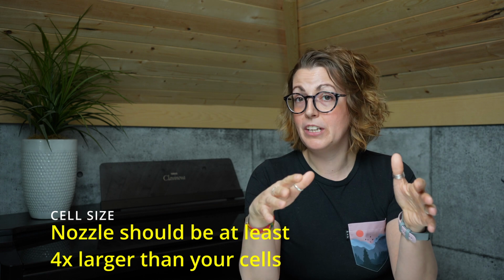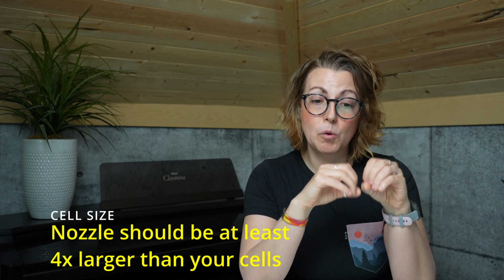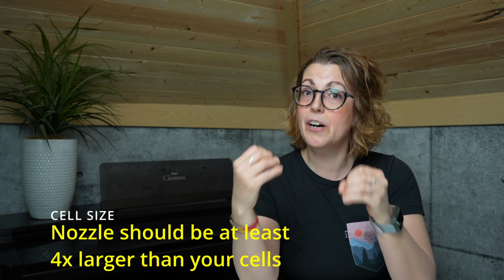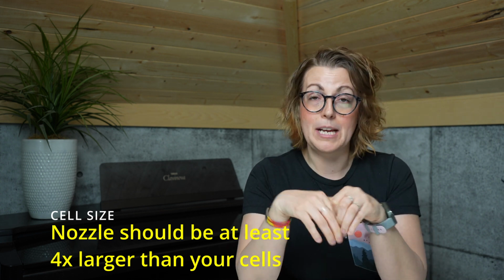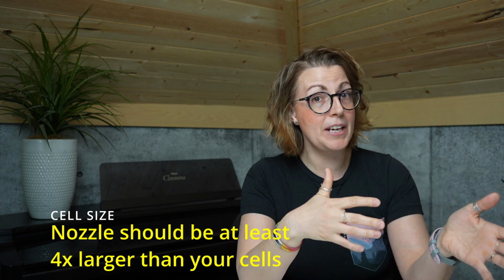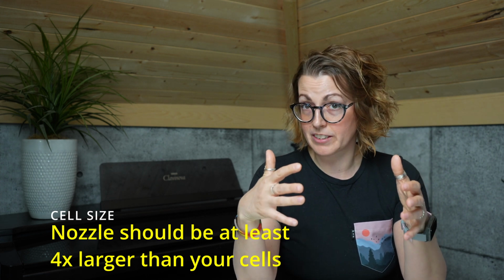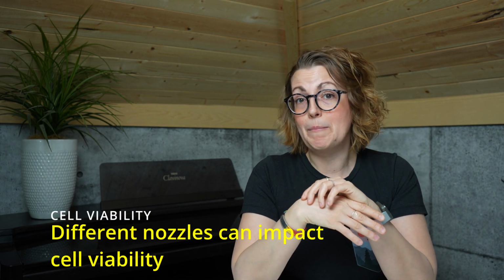As a rule of thumb, you will generally want the nozzle diameter to be at least 4 times greater than the diameter of the cell in order to allow the cells to pass through smoothly. For example, if you're using a 100 micron nozzle, the largest cell should be 25 microns. Smaller, probably better. You also want to think about your cell viability.